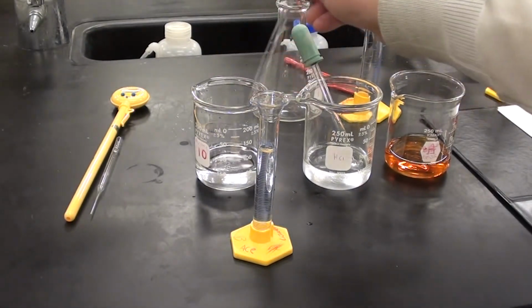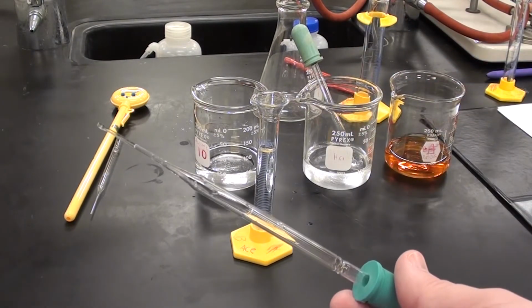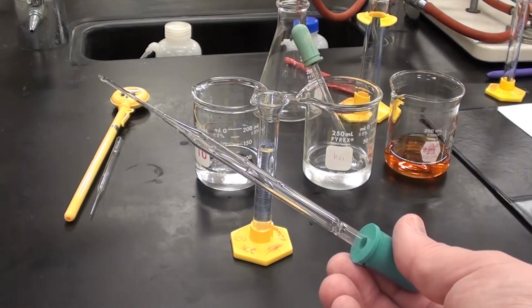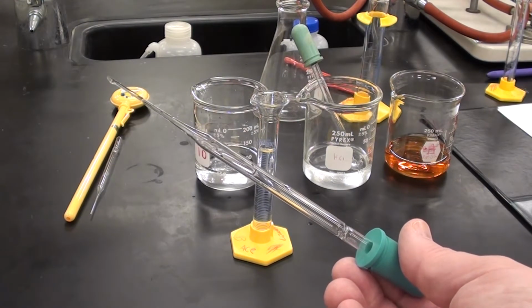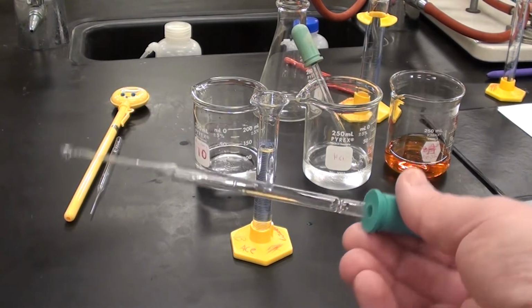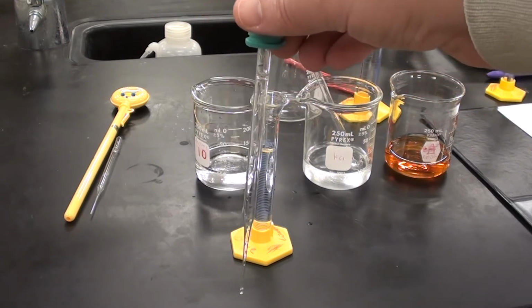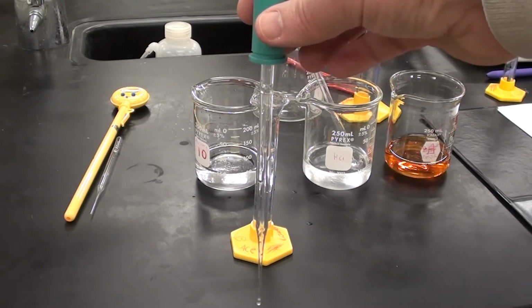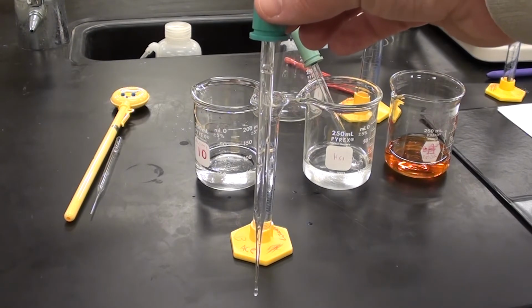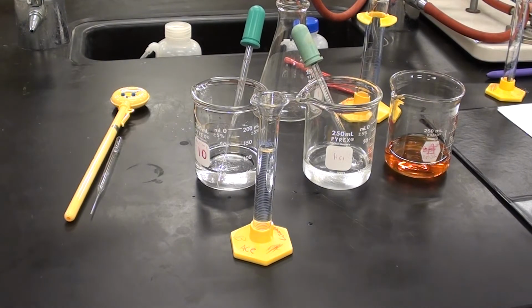One of the big temptations that people have with pipettes is they will tend to put them up like this when they're not using them. The problem with this is that the liquid that's in the pipette will tend to run into the bulb. If you can imagine everybody doing this and using all sorts of different liquids, there's going to be a lot of contamination when you put it up like this. So the best technique is to hold the pipette up like this at all times. As long as the bulb is good, the liquid should stay in the pipette and won't drip out. If you're concerned about it dripping out, simply put it back into a container and just let it sit there.